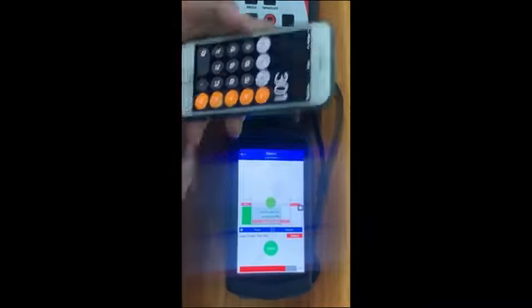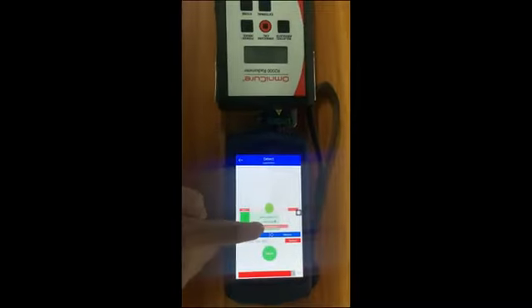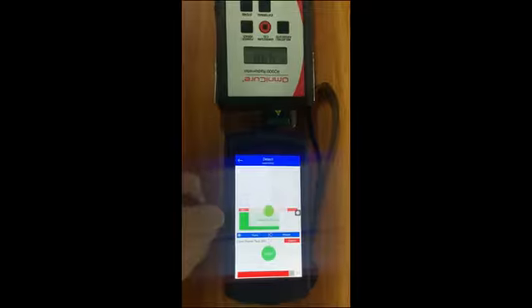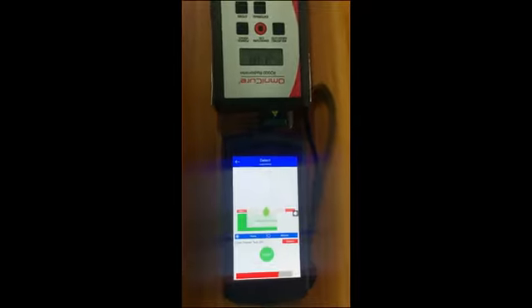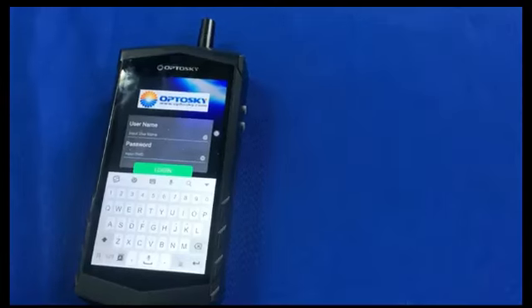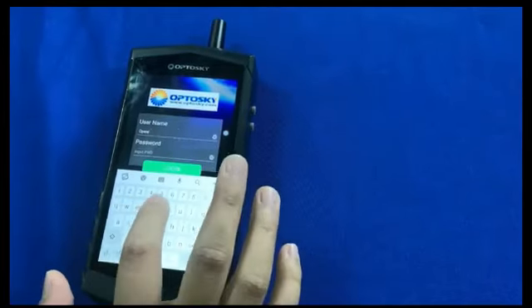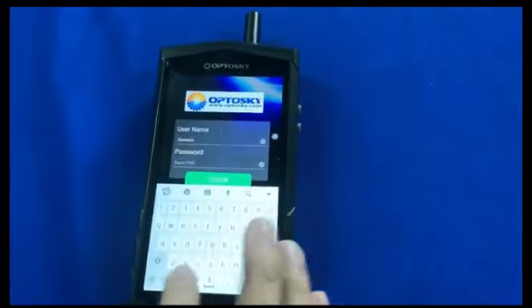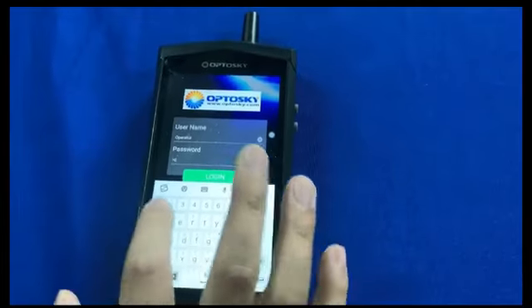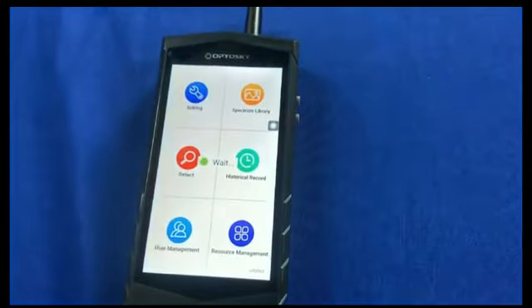Make sure the validation is linked up and press the button. And here you can see dictate. You can perform the self-validation test, and the test can pass. Then you need to execute e-signatures to complete test case 6.